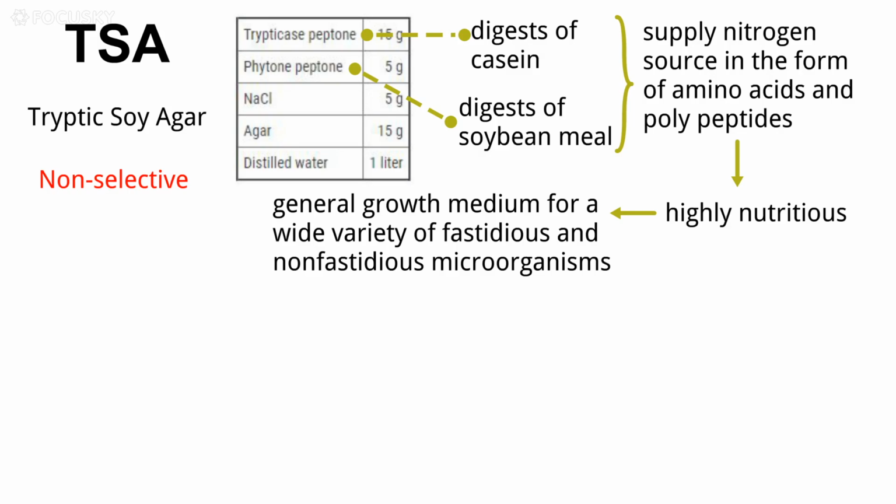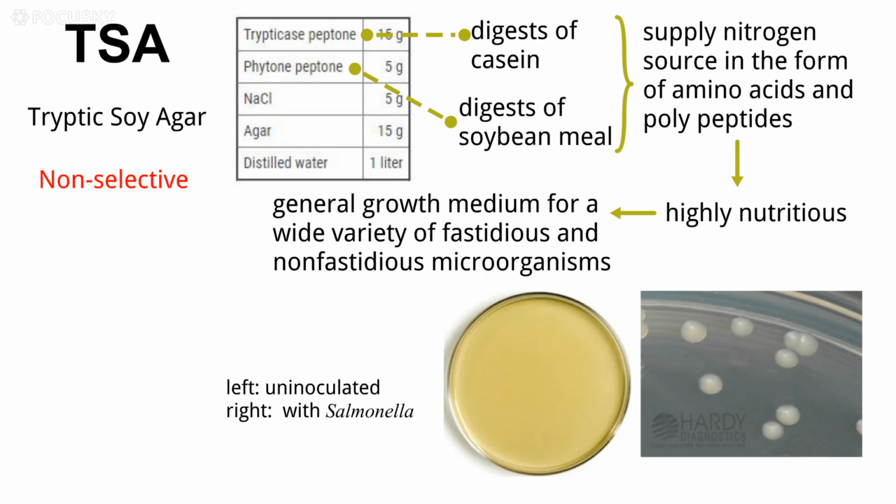Colonies on selective and differential agar plates are grown in a stressful environment and likely they do not show their typical physiological reaction. Therefore, we do not conduct confirmation tests directly from colonies on selective and differential agar plates. Instead, we allow them to grow on a nutritious and non-selective agar plate first. A typical Salmonella colony on TSA is creamy, round, and smooth with slight rise in the center.